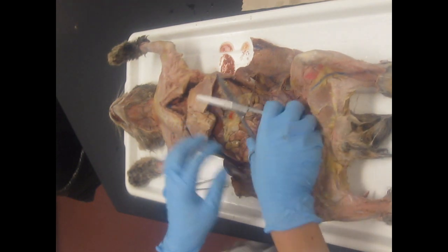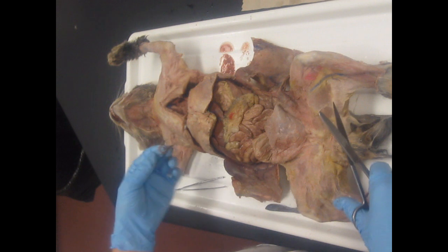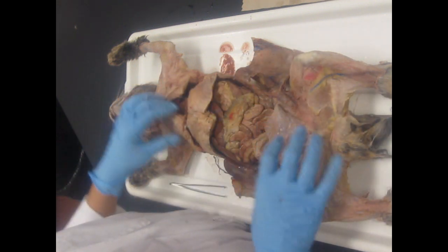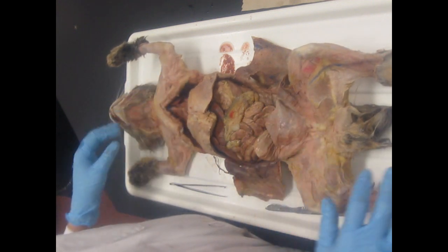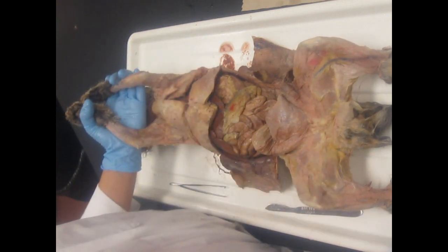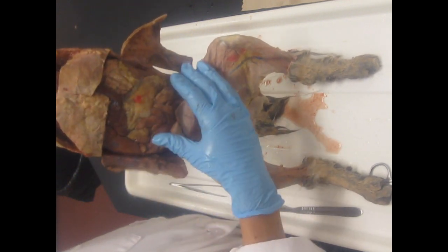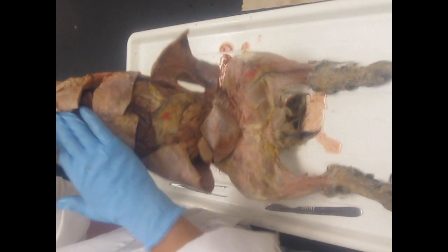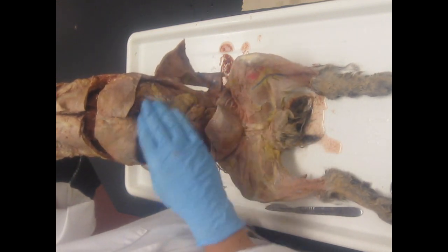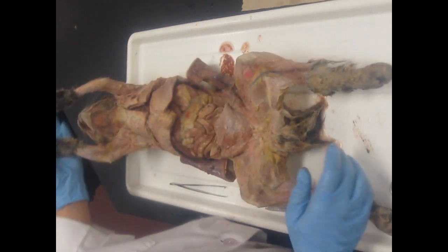Now you'll notice that it's kind of yucky in there. There's some congealed tissue, and some hair from when the company made their incision has gotten into the cavity. So again, once you're done with your incisions, you're going to take your cat over with your lab partner, stand them up in the sink, and rinse out the body cavities with the hose. Gently rub the organs as you do that, so that it gets all of this hair and congealed tissue and blood and stuff like that off from your cat.